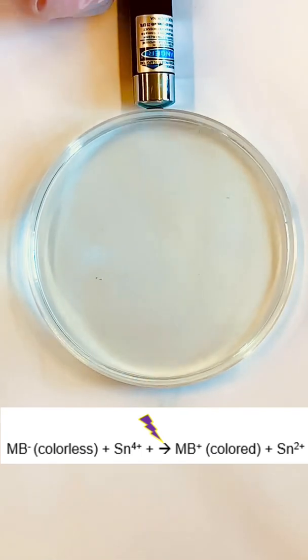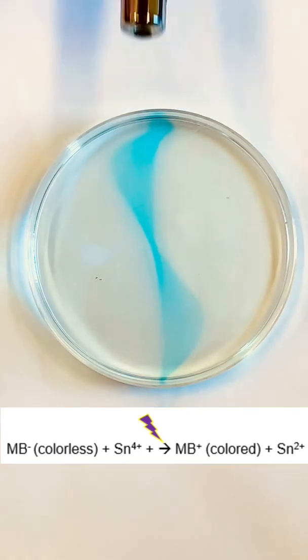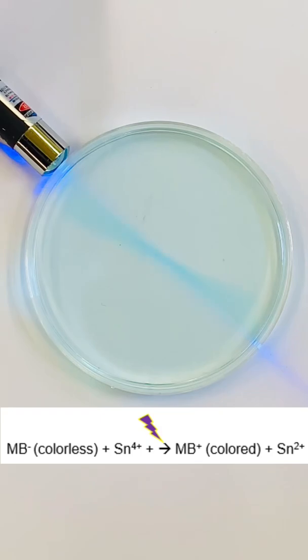Some pretty interesting patterns can be created if the solution isn't perfectly still. Small currents in the solution carry along the blue dye as it's formed and this creates the different designs.